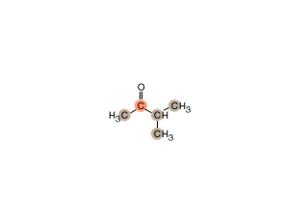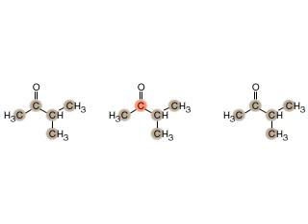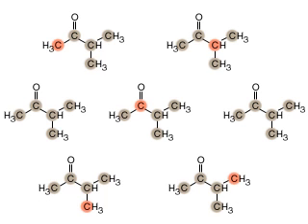Therefore, no single molecule gives rise to all the expected carbon NMR signals. Many molecules contain no carbon-13 at all. The large number of molecules in a sample, however, ensures that the NMR spectrum contains the signals for each carbon position with the same probability.